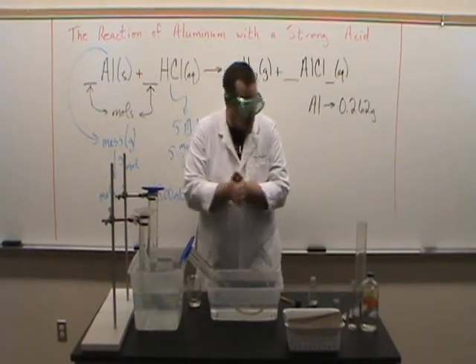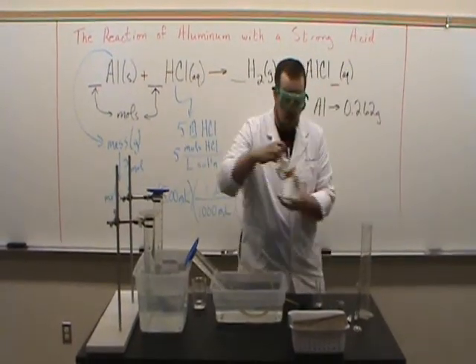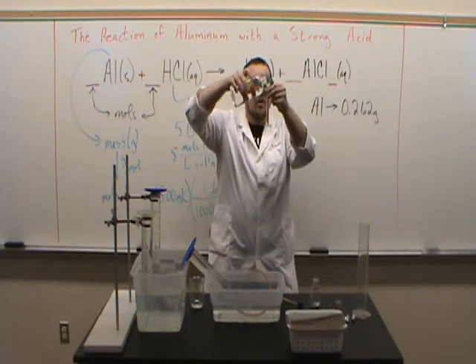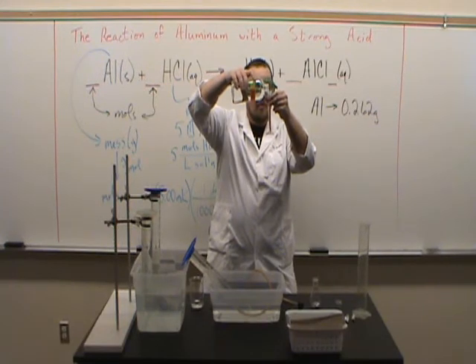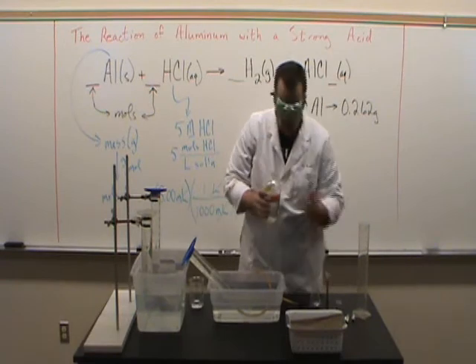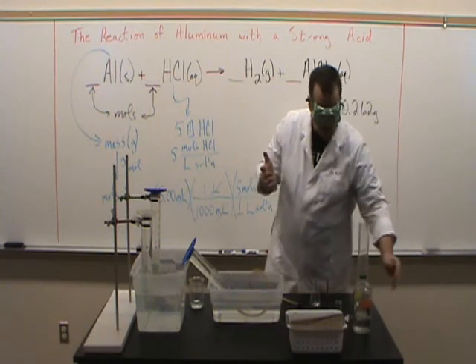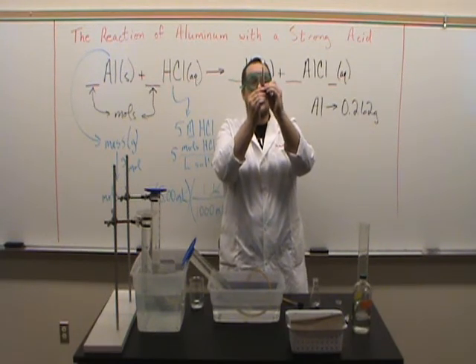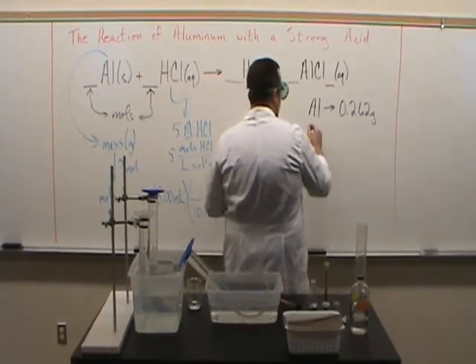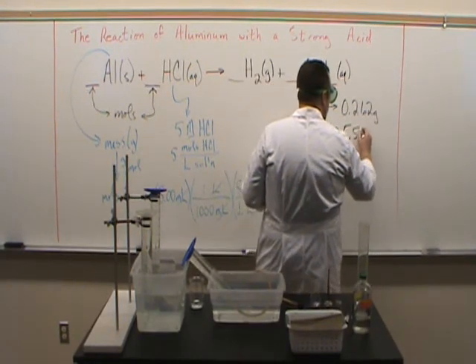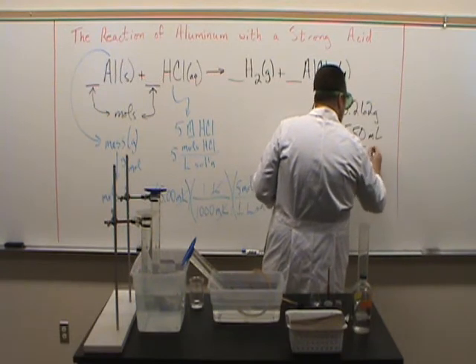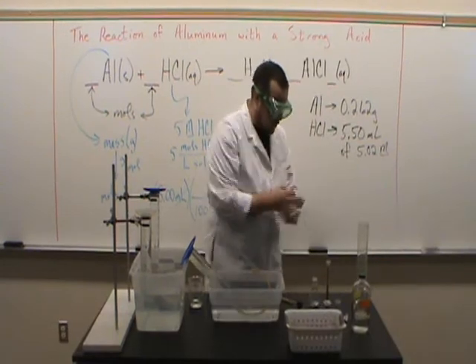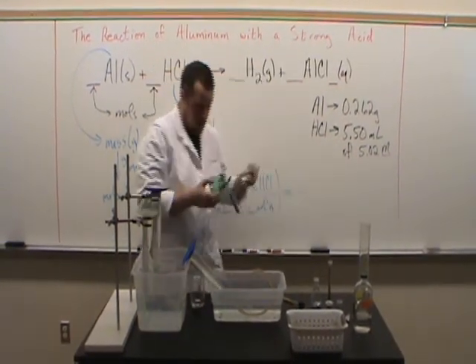It's starting to get exciting. So now what? We've got the aluminum. What about the HCl? Well, here is 5.02 molar HCl, and I can measure that with a graduated cylinder. And again, it would be nice if you were using exact amounts, but it's probably not the most crucial thing ever. So I've got 5.50 milliliters of HCl. These are the kind of things you want to be writing down in your lab notebook. Now, before we get started with this, I'll take a little break so that I can get the fog out of my goggles.